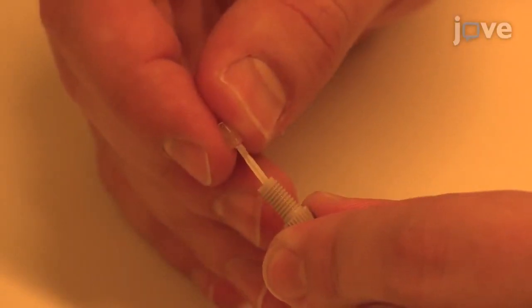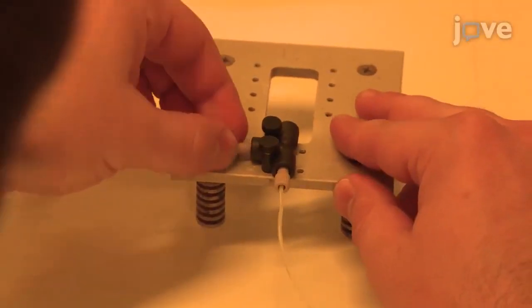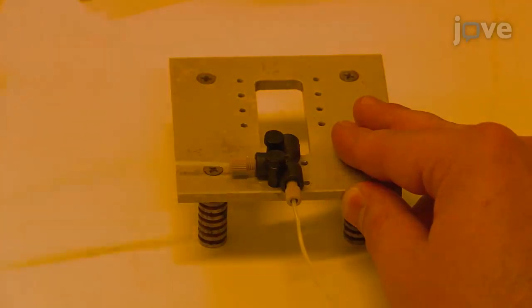Next, attach a fitting and a corresponding ferrule to the end of a second PTFE tube. Then, screw the tube to the lateral arm of the T-junction.